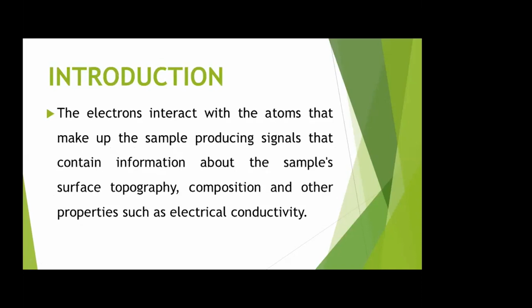The electrons interact with the atoms that make up this sample, producing signals that contain information about the sample's surface topography, that is how the surface of the sample looks, composition of the sample, and other properties such as electrical conductivity. It may not be so important in the case of Ayurvedic formulations, of course.